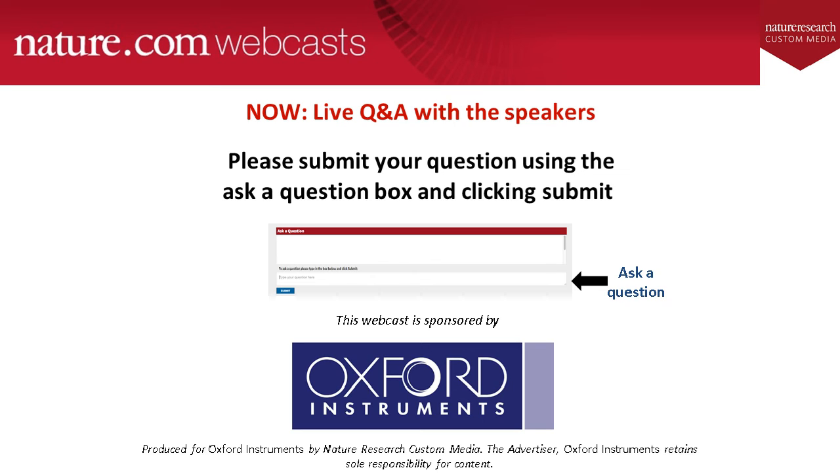Excellent. Thanks, Louise. And our next question asks, what is the difference in using TEM or SEM for EDS on biological samples? So there are a few differences in our detectors and the way that we operate the microscopes for TEM and SEM. In a TEM, we'd have to operate it in STEM mode so that we can scan across the sample. And in general, the sample actually has to be tilted slightly towards the detector in order to get the best angle for producing X-rays.